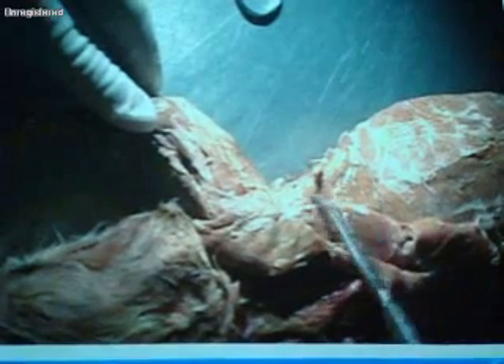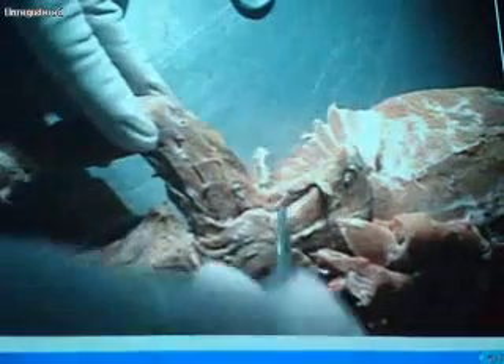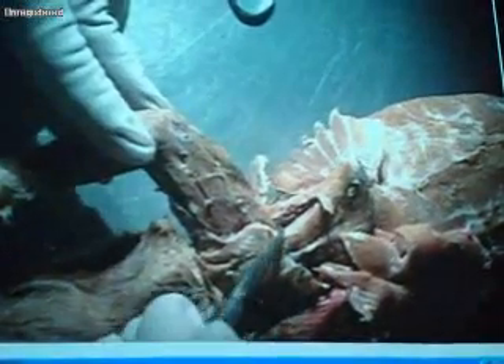Looking at the scapula itself, at the top you have the supraspinatus. There's the scapular spine — you can feel it. Right down at the bottom is infraspinatus. And then there's a muscle that goes from the scapula and inserts into the humerus — that's teres major, sitting right below infraspinatus. A little bit farther in is another very small muscle: teres minor. It's a very thin muscle right under here.